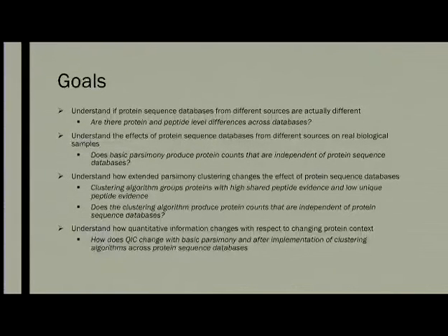The third goal is to implement these clustering algorithms, which are in a sense an extension to the basic parsimony logic. We wanted to see how this extended parsimony clustering changes the effects of protein sequence databases on protein and peptide characteristics. And we've implemented two different variations of these clustering algorithms.